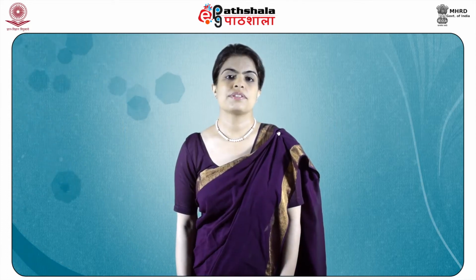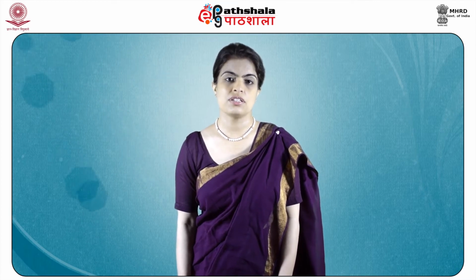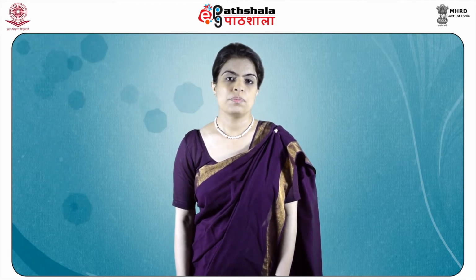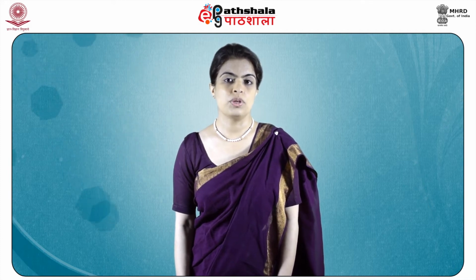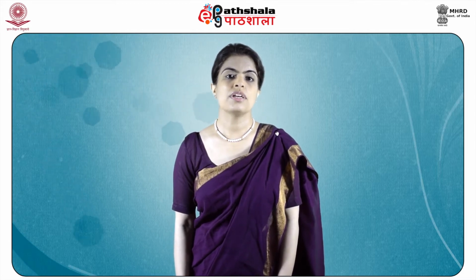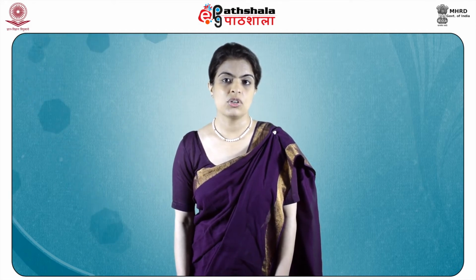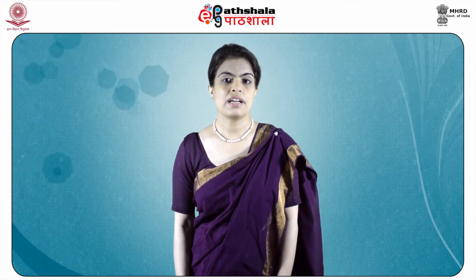Ion exchange chromatography is a technique used to separate proteins on the basis of the net charge carried by them. The magnitude of this net charge carried by the protein depends on the pH. Ion exchange columns consist of a solid polymer, which is a resin, onto which charged groups are bound. The solid matrix or resin can be of different varieties. These include matrices made of polystyrene, cellulose, agarose.